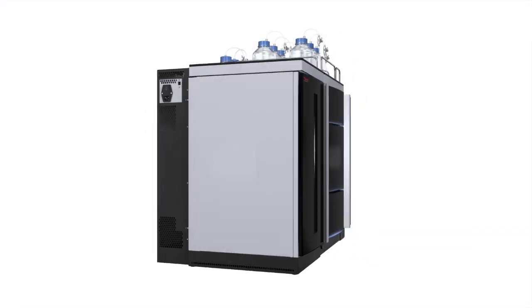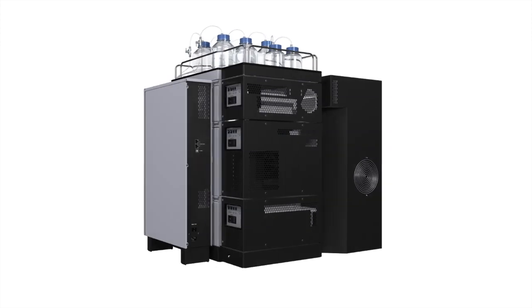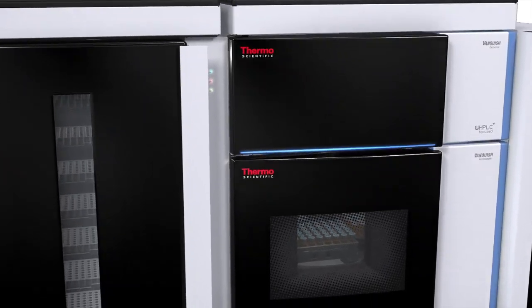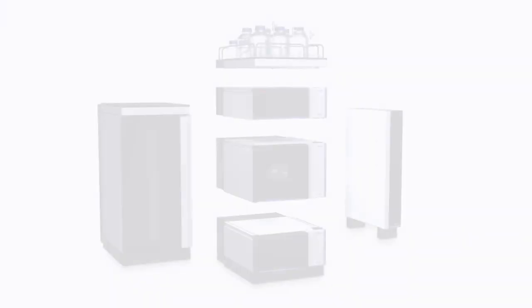Make your life as a chromatographer easier by seeing what you couldn't see before and doing what you couldn't do before. In 2010, we embraced UHPLC as the standard for all our liquid chromatography systems. Now we offer the Thermo Scientific Vanquish UHPLC system, combining all our knowledge and passion for chromatography into one revolutionary instrument.